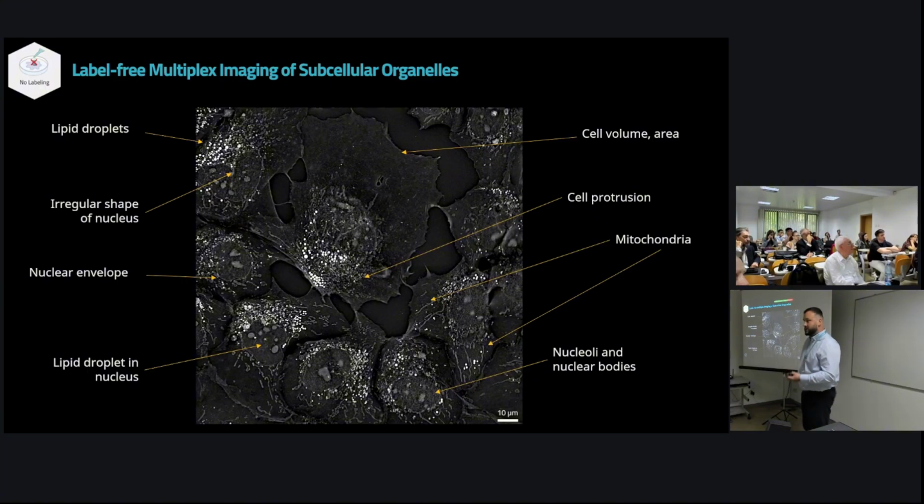Morphologically, we can confirm that that's a nucleus. You can also label it once, confirm that it's really a nucleus, and now you know from here on. But I'll touch on that in a second. You'll see the mitochondria, you see the whole cell in here. So you always have to remember it's label free, 3D, and quantitative, but it's not specific.